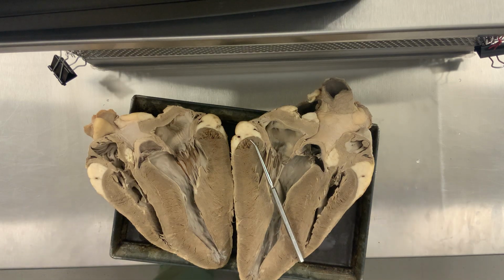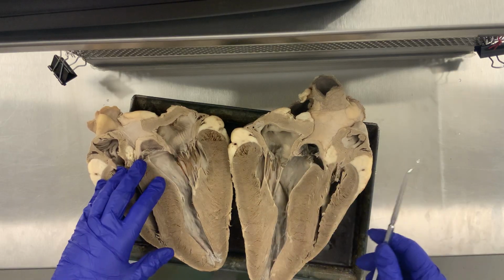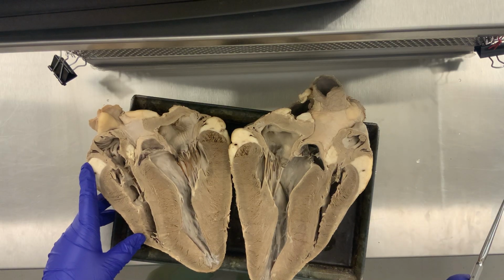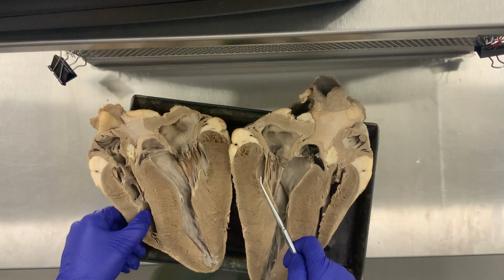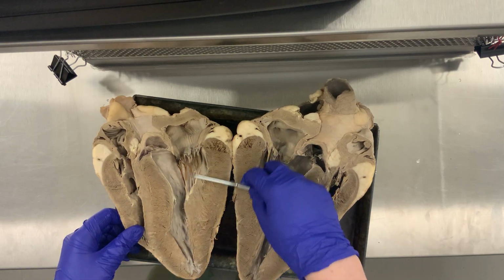Okay guys, so right now I'm going to walk you through the cow heart. When you're looking at a heart that is bisected like this, the first step is to orient yourself, so figure out which side is left and which side is right. The way to figure this out with a bisected heart is to look for the thicker ventricular myocardium. You can see that this is about a third of the size of this side, which would mean that this is going to be the left side of the heart.